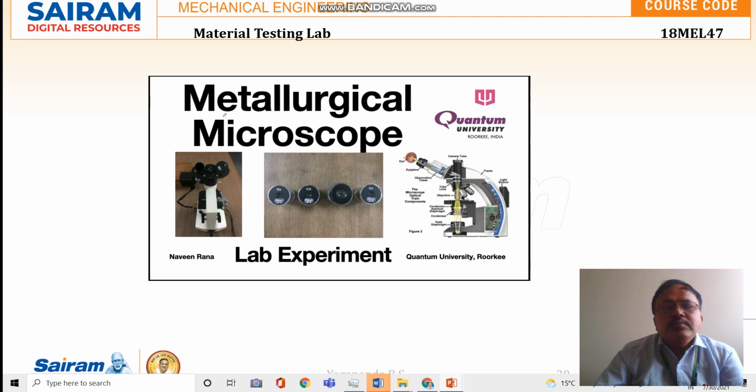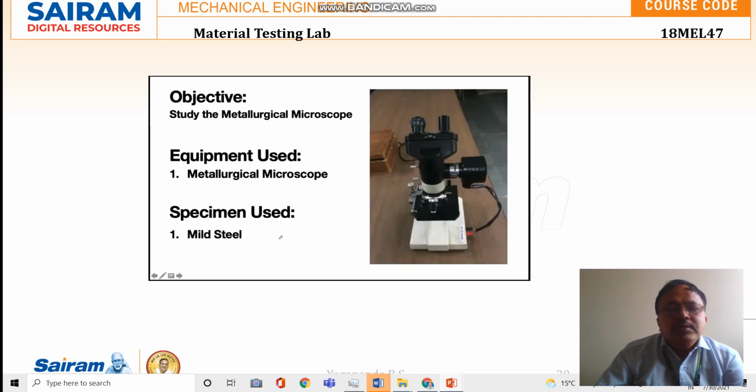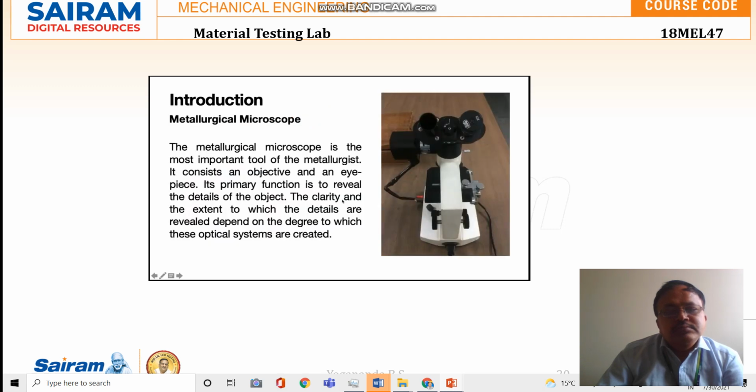Hello students, in this video we will be learning about the basic principle of a metallurgical microscope. So let's get started. Our objective is to study the metallurgical microscope. We are using one of the metallurgical microscopes which is available in our lab. At the end of this video, we will also see the microstructure of a mild steel specimen through this metallurgical microscope. The metallurgical microscope is one of the important tools used by the metallurgist.